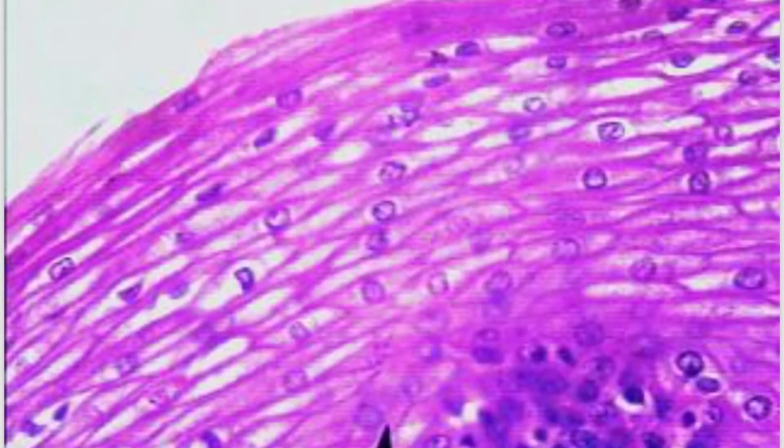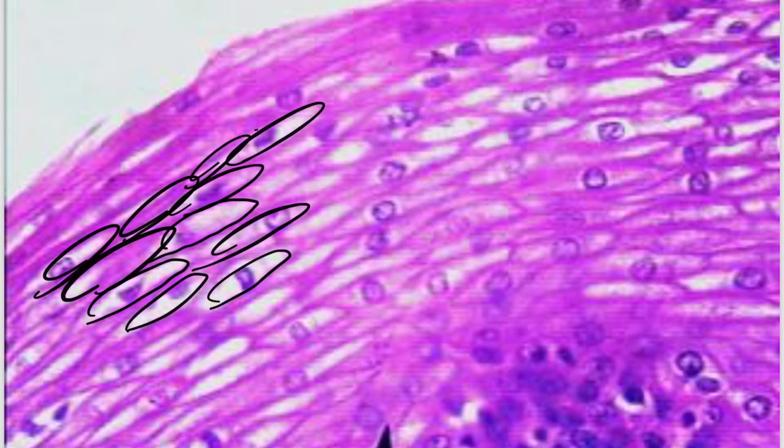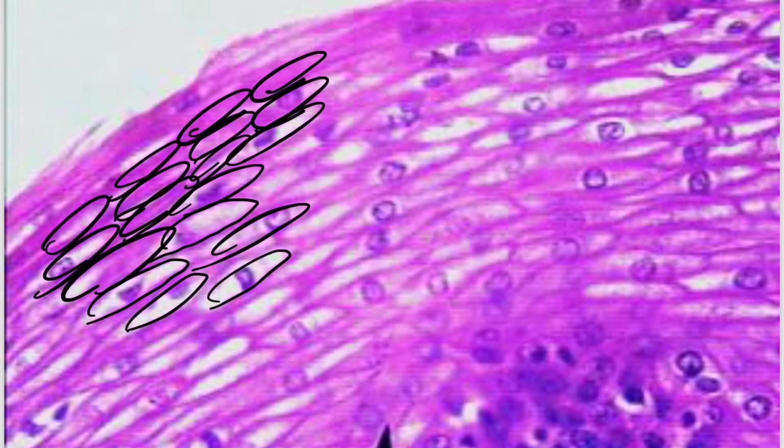This one is so much better. So you can absolutely see these pancake-shaped cells. They kind of look like eyes, right? All of these are cells just lying on top of each other. So this is stratified, clearly more than one layer, and they're just a bunch of cells lying on top of one another.